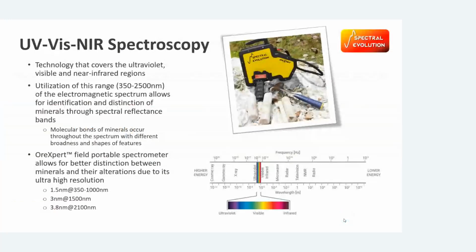So on to the technology that we used. Again, I did mention in the very beginning, some of you here are senior users of this technology and some of you are just beginners. So I'm just going to go through an average spiel of the instrument that we used and essentially what it does. So again, we utilized UV, vis, and IR spectroscopy as our technology for this study.